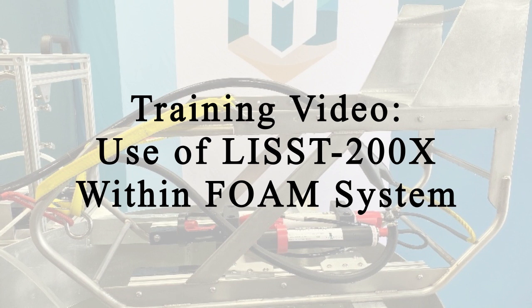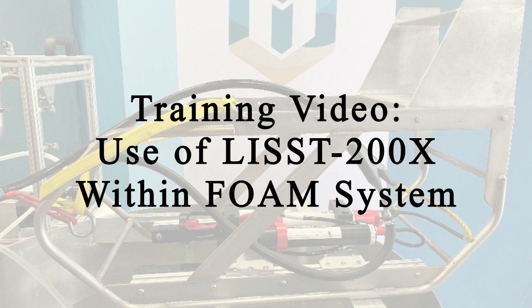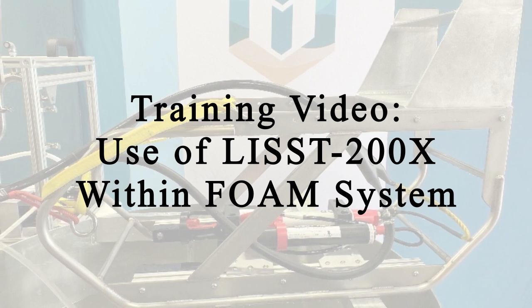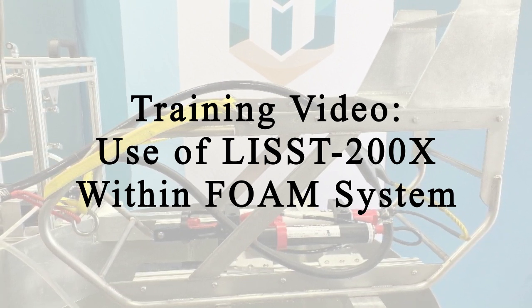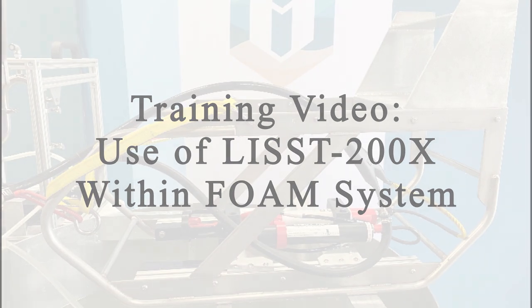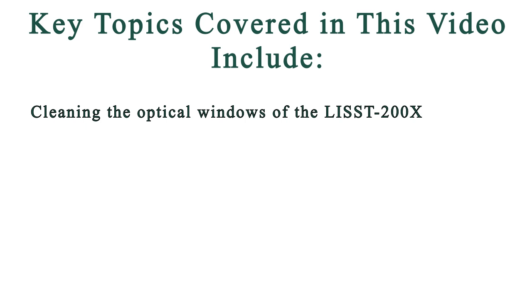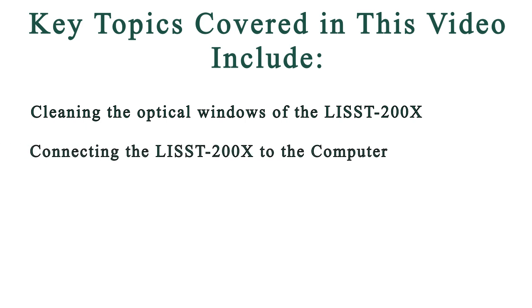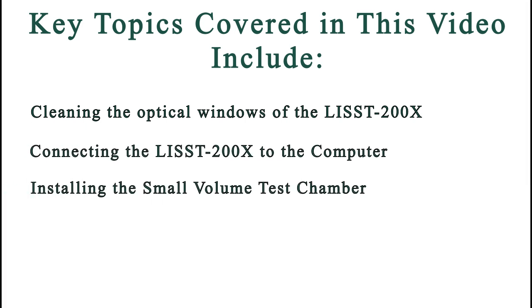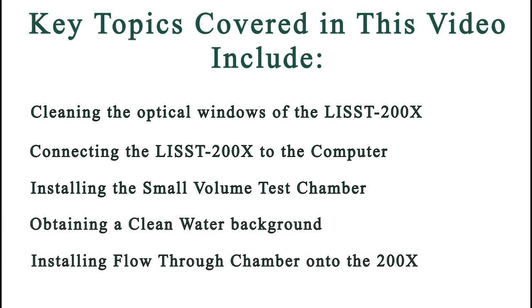This training video is specific to the LISST-200X laser diffraction-based particle size analyzer, which is installed within the fast oceanographic automated monitoring foam system. We discuss the fundamental practices which are performed each day as part of the operation of the system. The topics we will discuss are cleaning of the optical windows of the LISST-200X, connecting the LISST-200X to the computer, installing the small volume test chamber, obtaining a clean water background, and finally, installing the flow-through chamber onto the 200X.